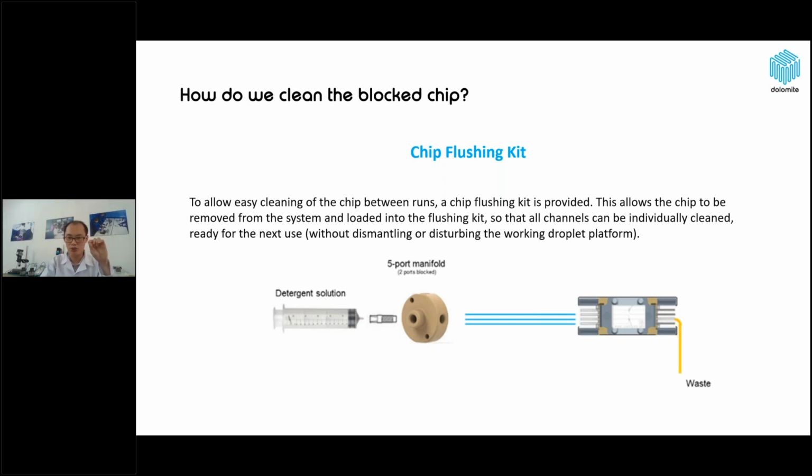If you use the small drop junction chip, the chip connection is a top surface connection interface, so you should use the top interface with the linear connector. This connects with tubing and simple syringes that can pump solvents quickly to the chip with a simple experimental setup.